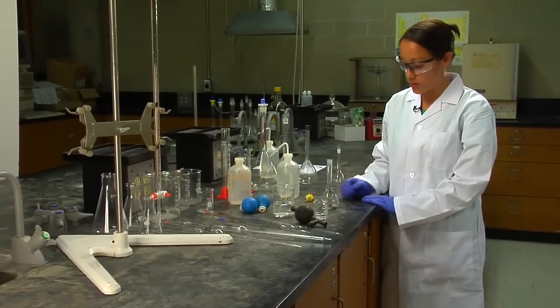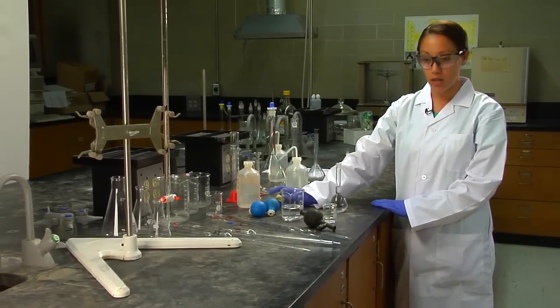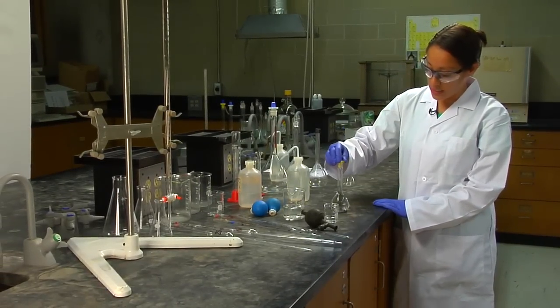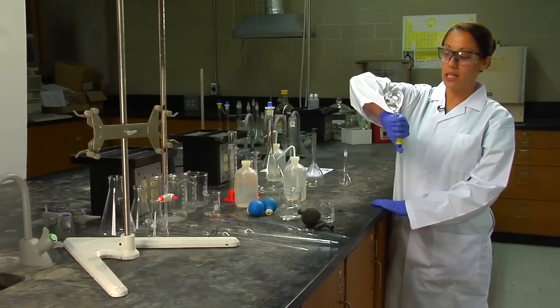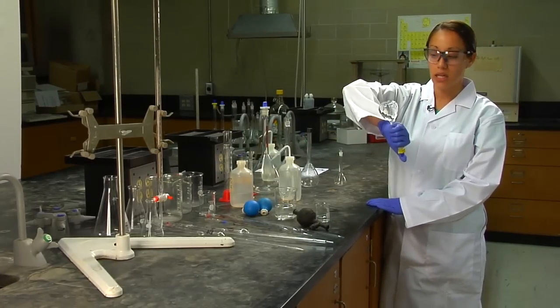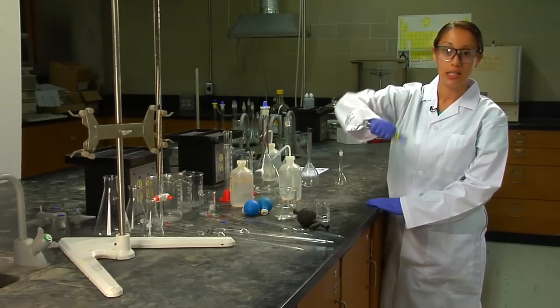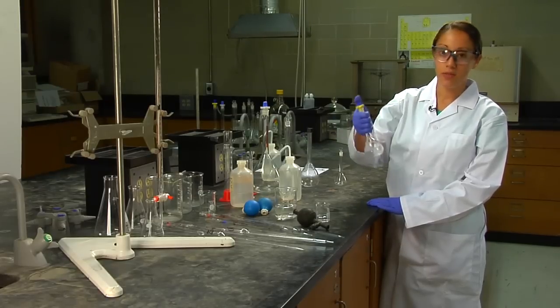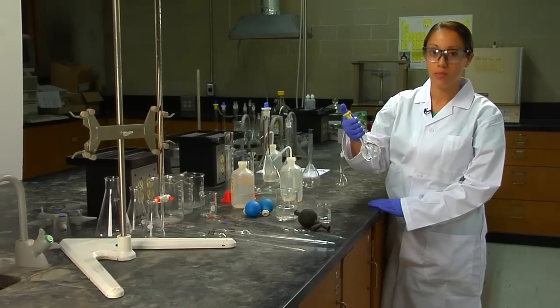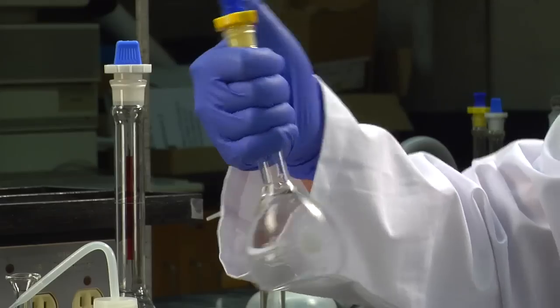You've successfully diluted your 100 ppm stock to 2 ppm. The last part of this is to invert it at least 10 to 20 times to ensure complete mixing, and then you've successfully prepared a 2 ppm standard solution for your experiments.